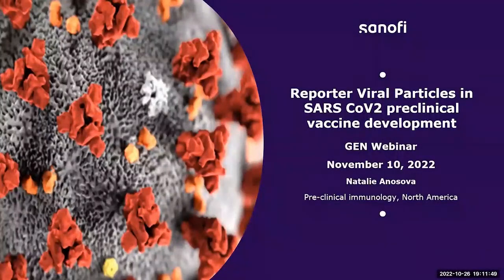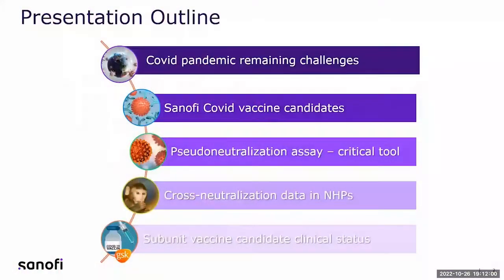I'd like to thank Integral Molecular for inviting me to speak about our experiences working with SARS-CoV-2 reporter-viral particles to support preclinical development of our subunit vaccine. This is the outline of my presentation. I'll touch on the remaining scientific challenges in the COVID pandemic, talk about Sanofi COVID vaccine candidates, share details about pseudoneutralization assay development using pseudoviral particles, share with you some preclinical data in non-human primates looking at cross-neutralization, and then give you an update on subunit vaccine in clinical trials.